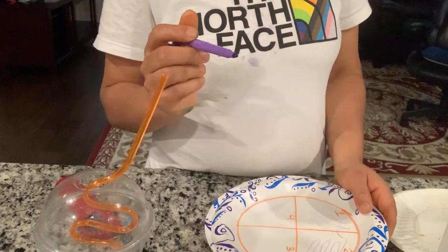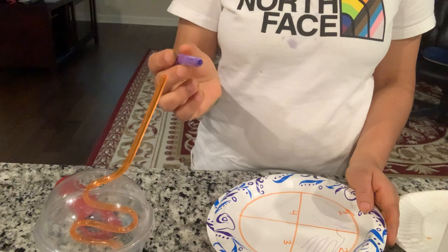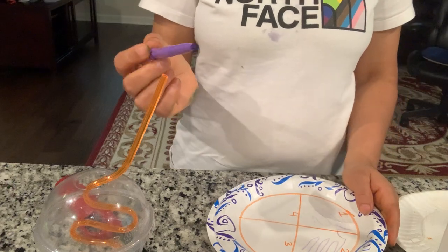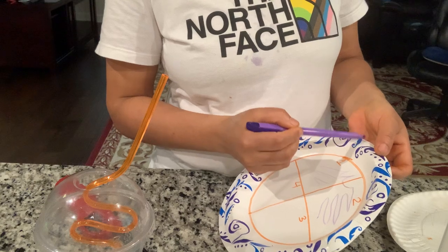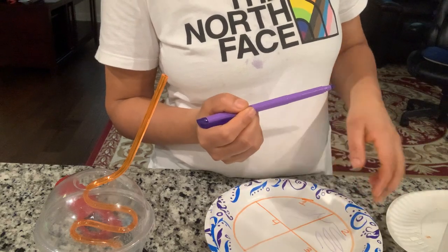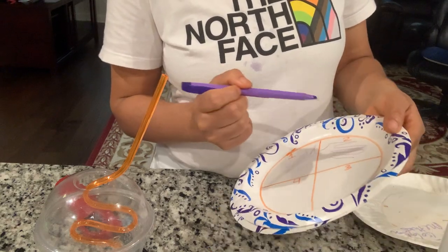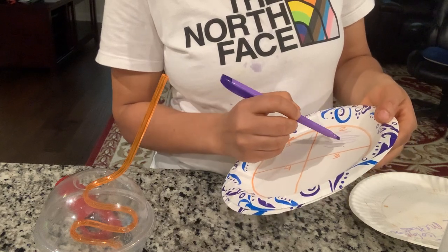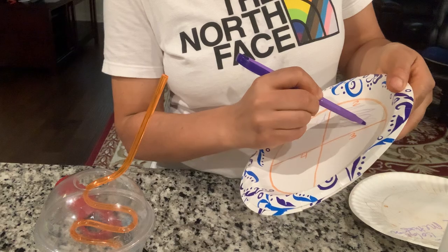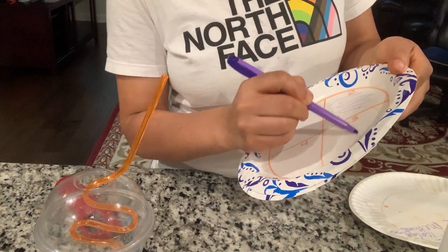Again I need to put the loop on the flame for sterilization and let it cool down. I'm going to draw quadrant three using some sample from quadrant two. And this is my quadrant three.